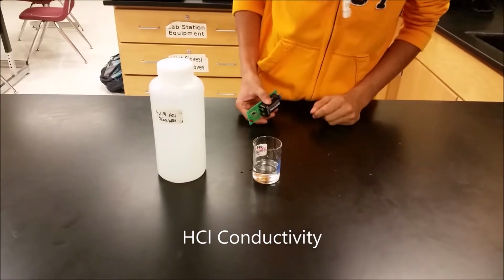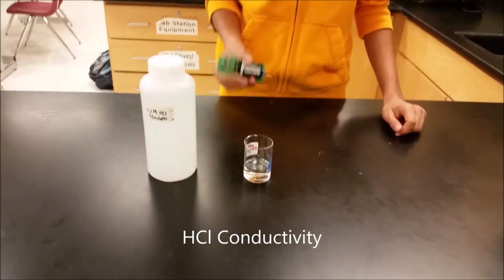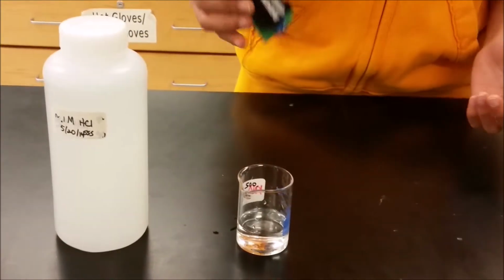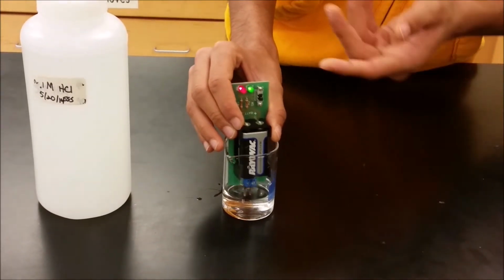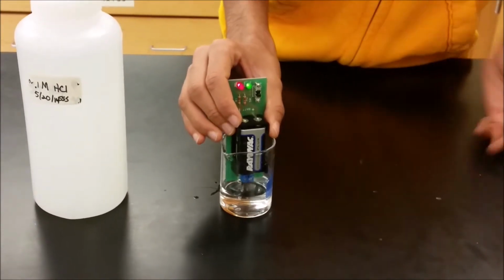This time we have 0.1 molar HCl, and I again poured 40 milliliters of it into this beaker, and again we're going to test the conductivity of the solution with this conductivity probe. So as you can see, the probe is again lit bright red, and it's dimly lit green.